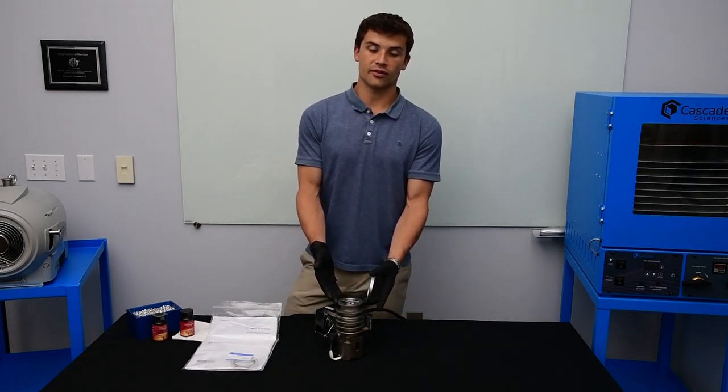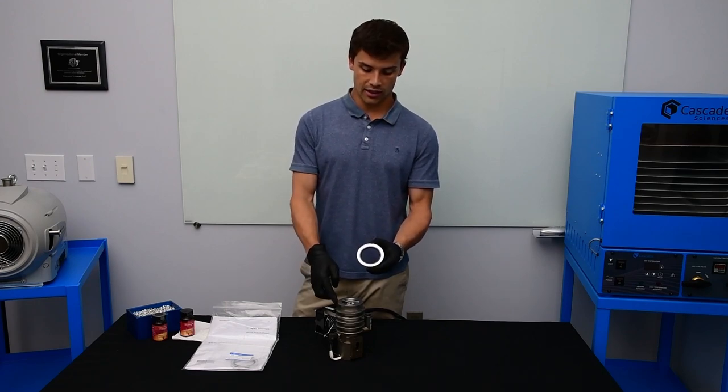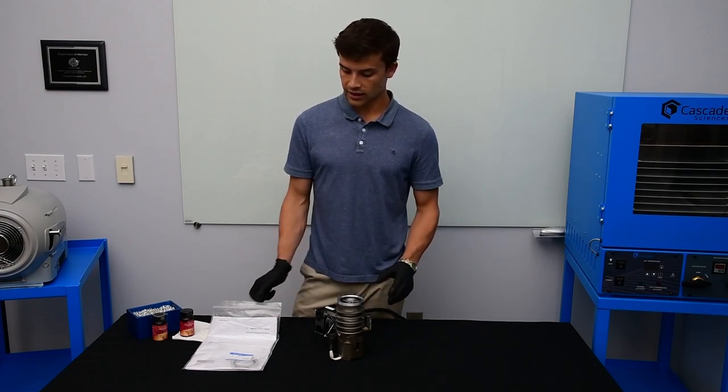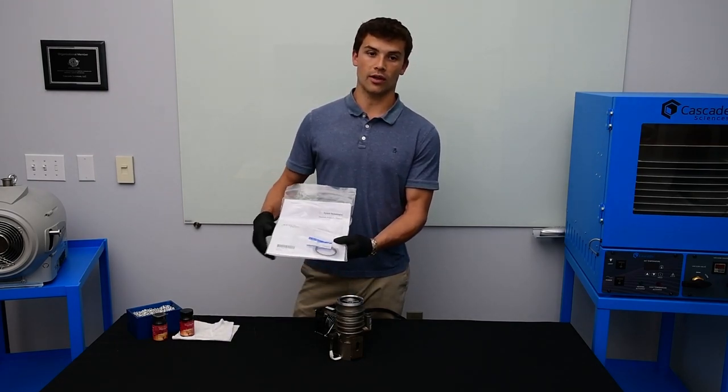This is a KF50 flange that has a special centering ring. This centering ring goes on the exterior and is included in the manual in the bag. Don't throw this out when you get your new box.